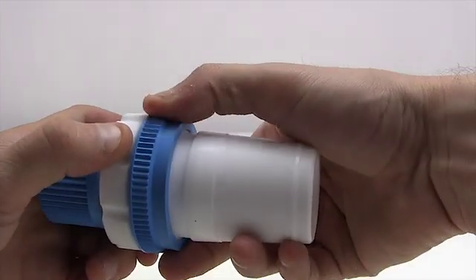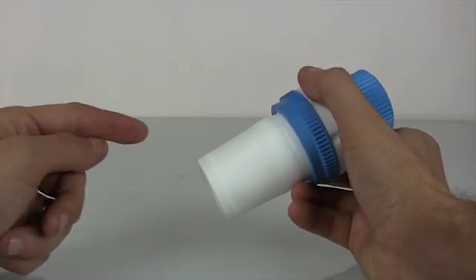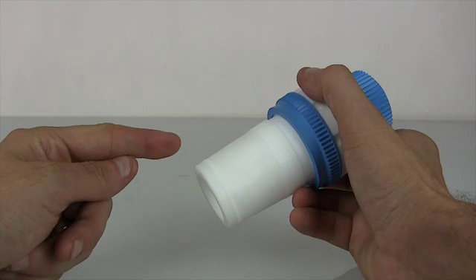Until it stops. One key note: the standard taper joint of the bearing is matched for a specific center neck of the flask or vessel, and is good for vacuum applications.